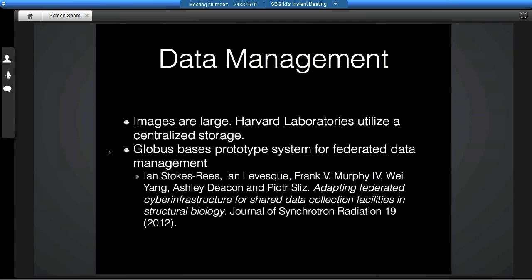So it's been presented as a big problem of the community, but if you think about it, it really isn't, and electron microscopy and our colleagues in structural biology are taking on problems like this on a daily basis. I think unmerged data is certainly the way to go, but from our perspective, we argue that the value of the raw images that you collected is in many cases something we as a community should try to address and tackle in the future.